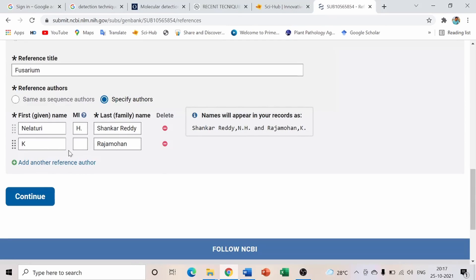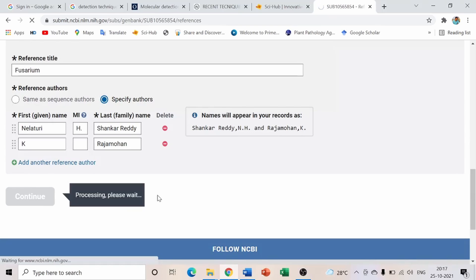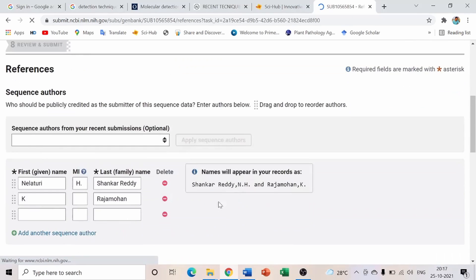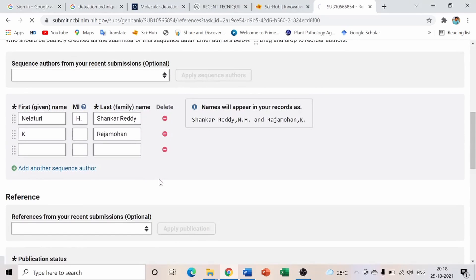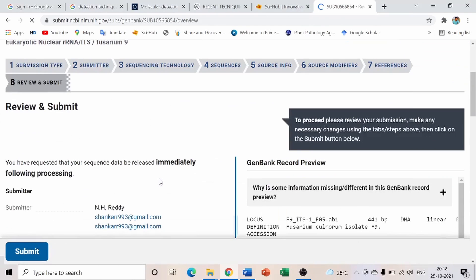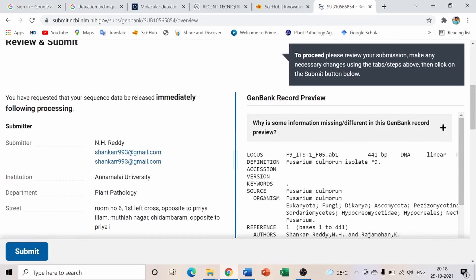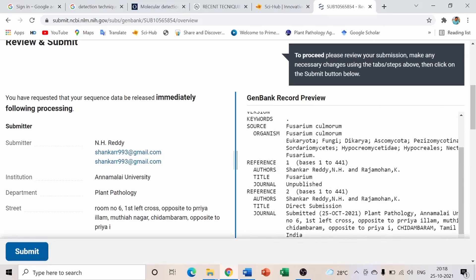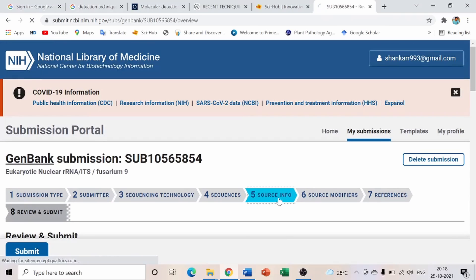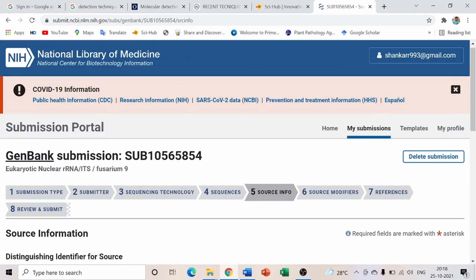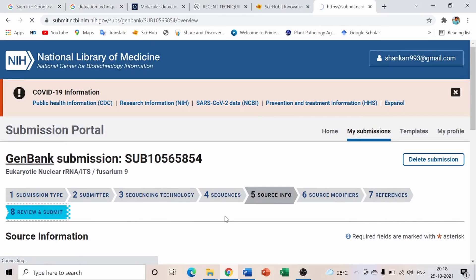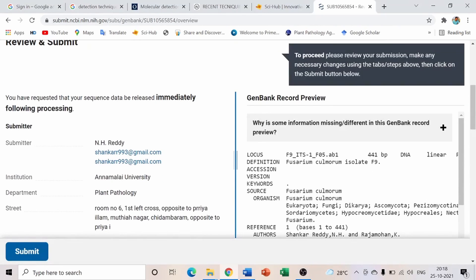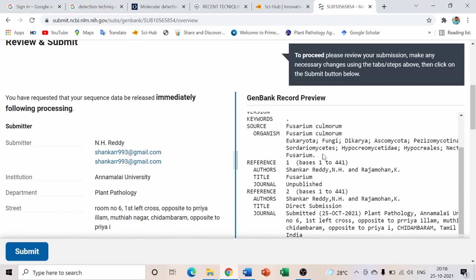Once authors are added, click 'Apply Sequence Authors.' It will show the reference and submission title. You can select 'Unpublished' for publication status. Add the title and specify authors — same as sequence authors — then click Continue.